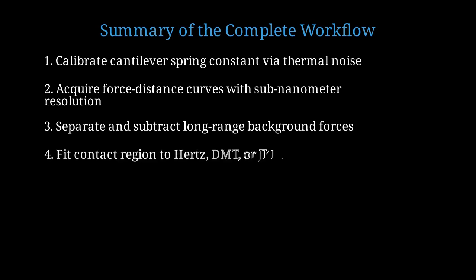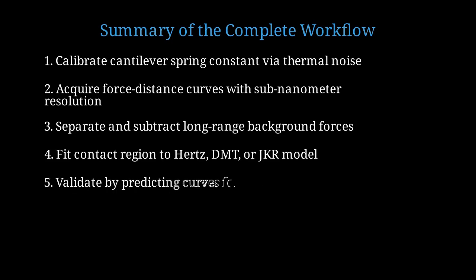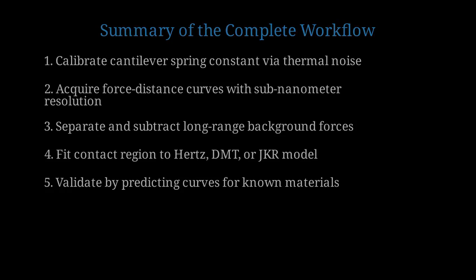Step 4. Fit the contact region to an appropriate contact mechanics model. Choose Hertz, DMT, or JKR based on your material system. Extract elastic modulus and adhesion. Step 5. Validate your entire pipeline by measuring materials with independently known properties. If you can't predict literature values, something is wrong with your calibration or analysis.